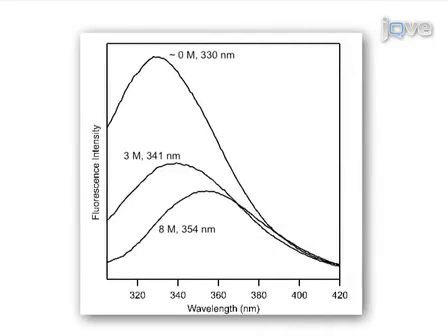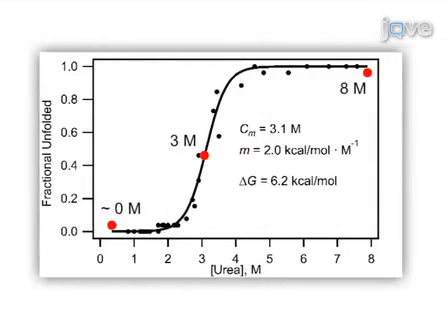Next, the tryptophan fluorescence spectrum of each sample is measured in order to gather data required to generate a membrane protein unfolding curve. Results are obtained that show how the Gibbs free energy of membrane protein unfolding can be obtained based on unfolding curves generated from tryptophan fluorescence spectra.